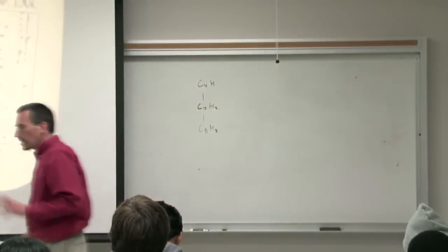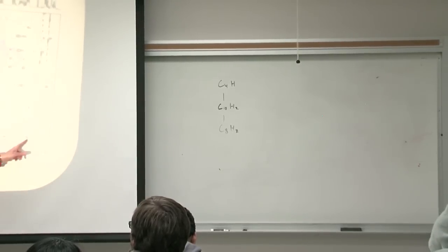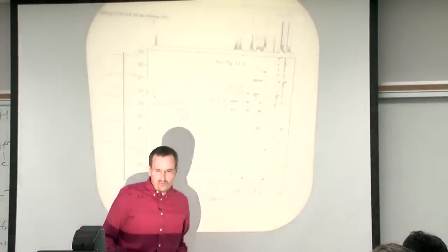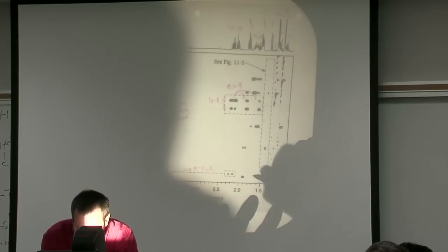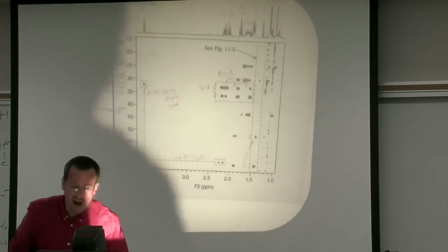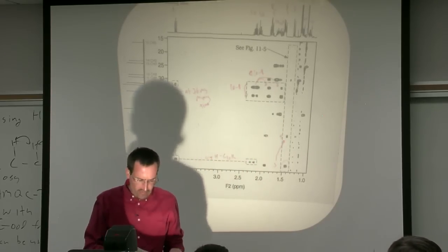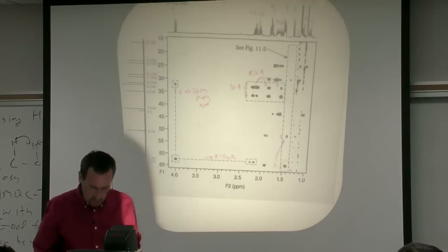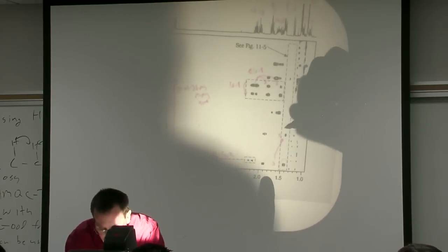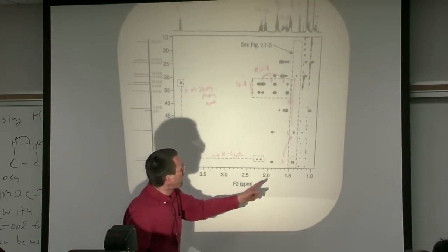All right, let's at this point tackle the next spin system in the molecule. And so what's nice is we've got a nice clear shot off of C3. You could work off of other parts if you want, but let's just work off of C3. Now this is our 14 millisecond one. And so here we've gone from 3, and at this 14 millisecond one, 5 is starting to pop up, has popped up. And then we're starting to have the next one pop up, which is to, let's see, I'm having a little trouble seeing my alignment here. It is to 12.